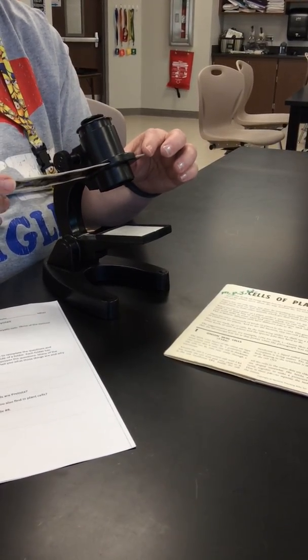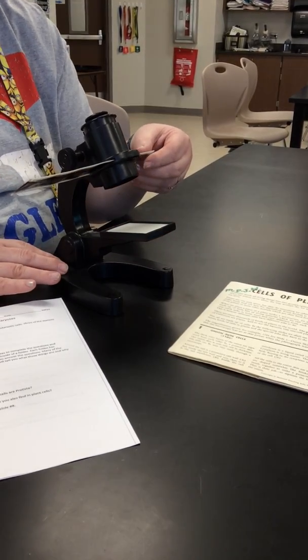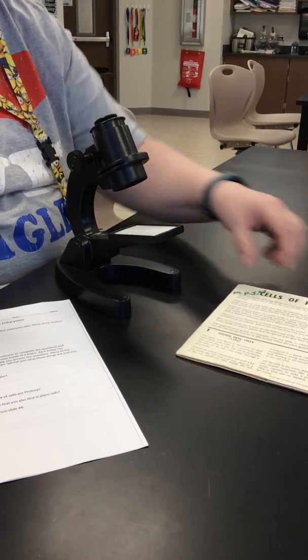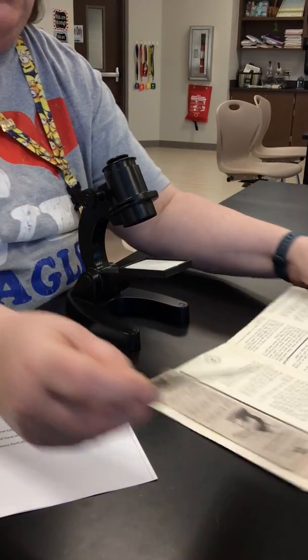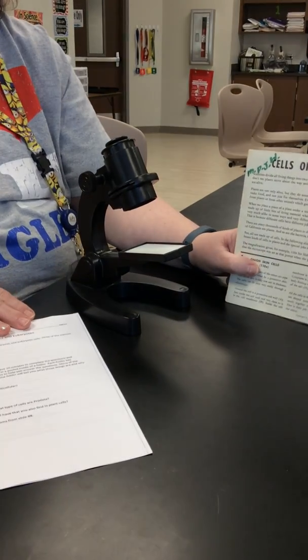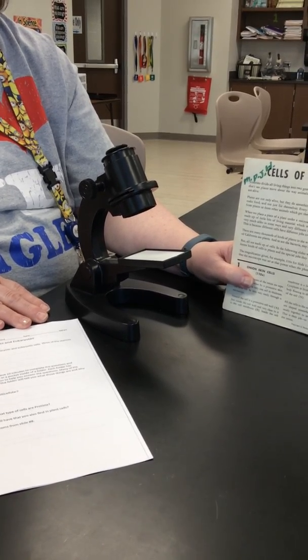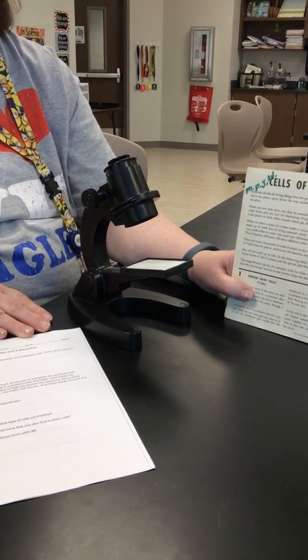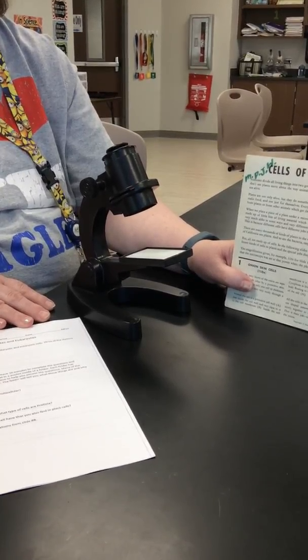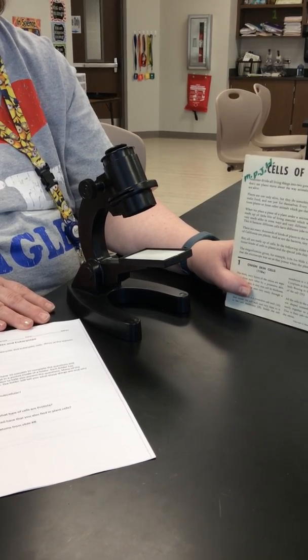It's a lot of fun and they're pretty easy to use — pretty low-tech. As you finish at a station, please take the slides, put them back in the pocket in the envelope, and leave everything nice and neat for the next group. You'll be doing three stations on Friday and three stations on Monday, and I think you're going to love what you see — you'll get to see a lot of details about the cells, and it should be very informative and interesting.